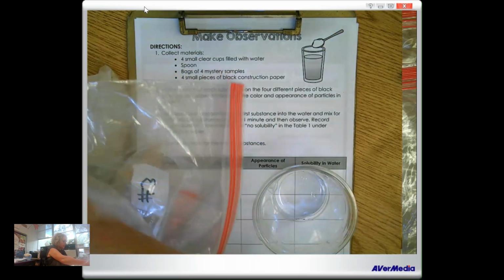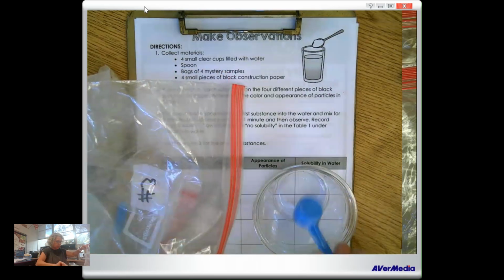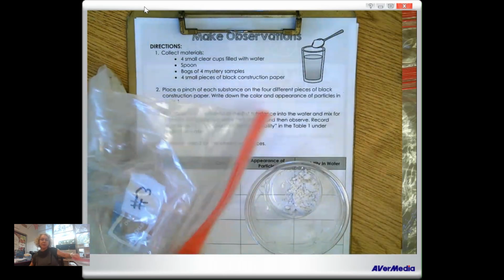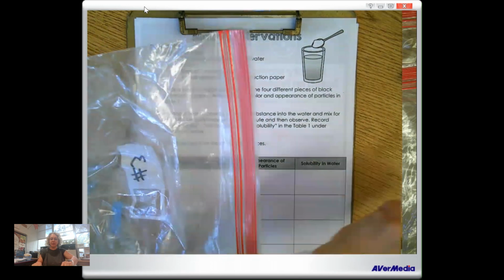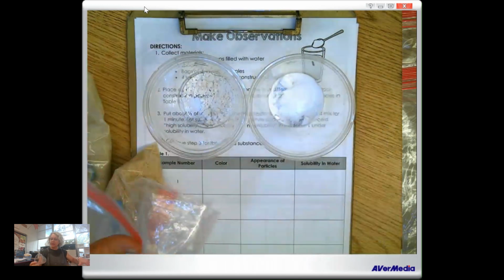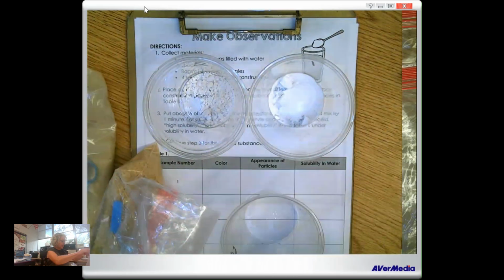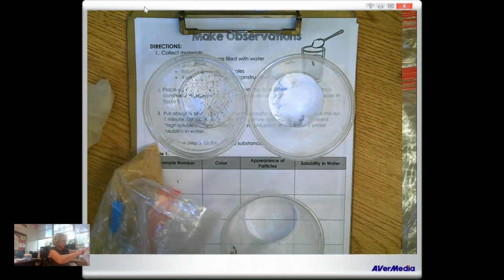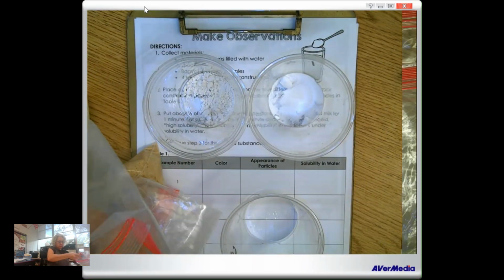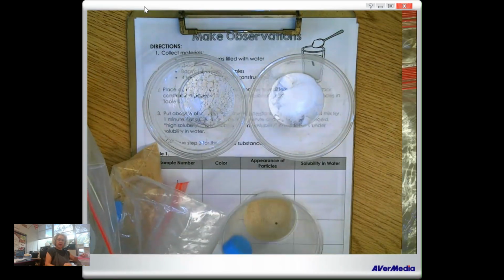All right, a spoon of 2. Get in there, 2. All right, a spoon of 3. Maybe I should put them over here to, oh, no, here. To let you know I've done it. A spoon of 3. There we go.